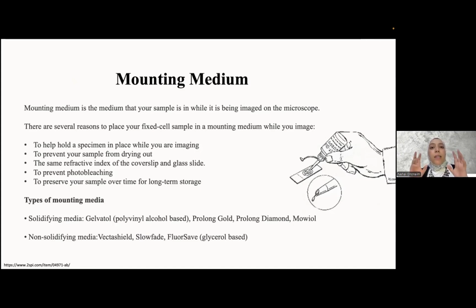Here comes our hero, the mounting medium. Mounting medium is the medium that your sample is in while it is being imaged in the microscope.